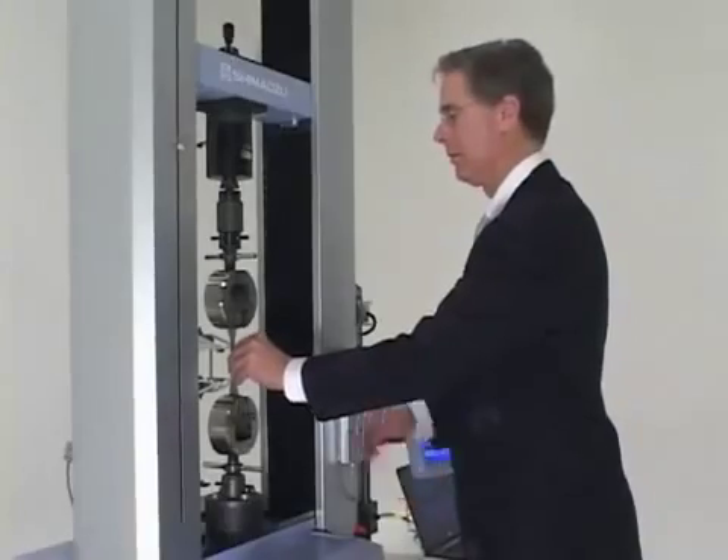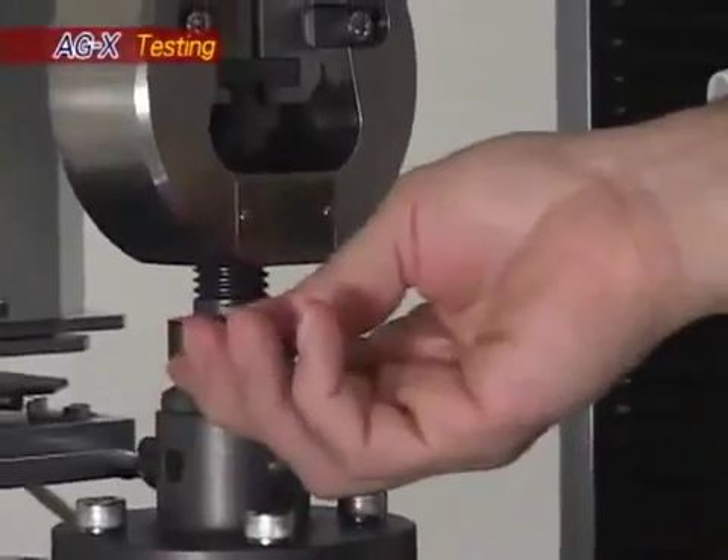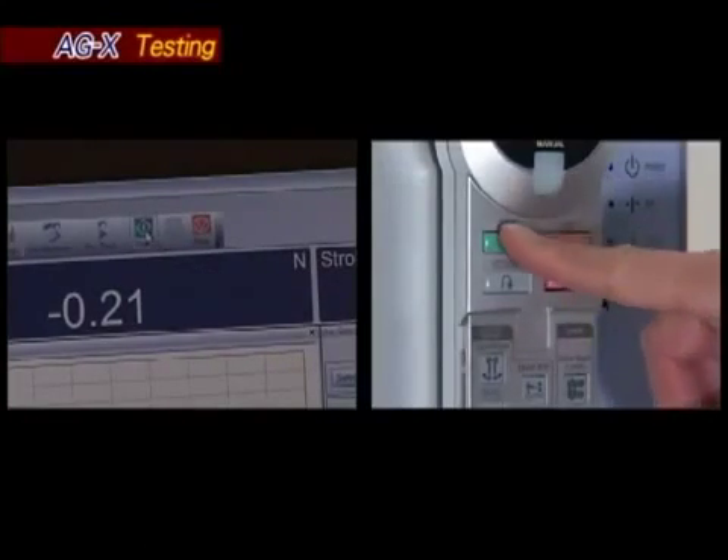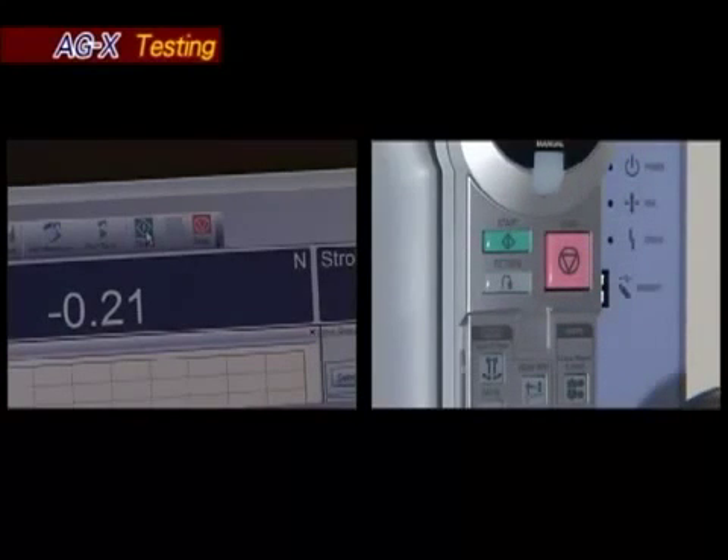Accurate measurement. After testing parameters are entered, the system is ready to start tensile testing. With AGX models, testing can be started either from the computer or from the testing machine.